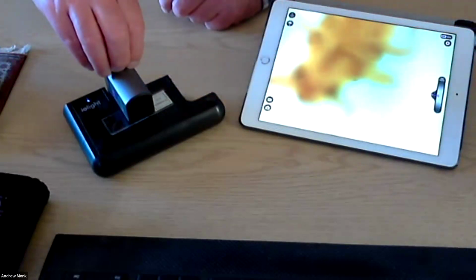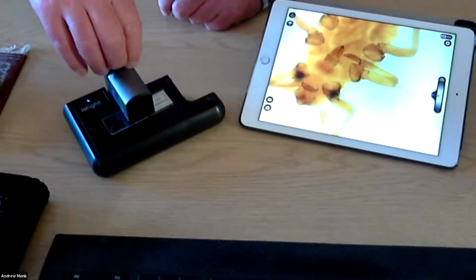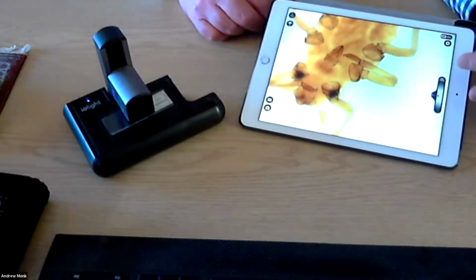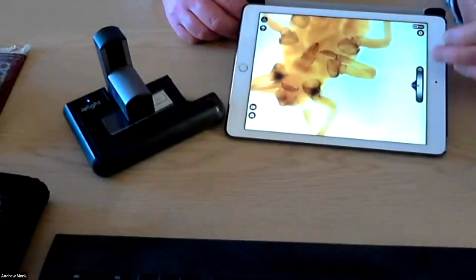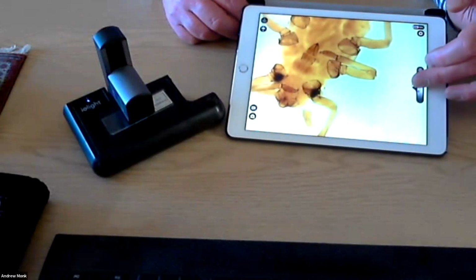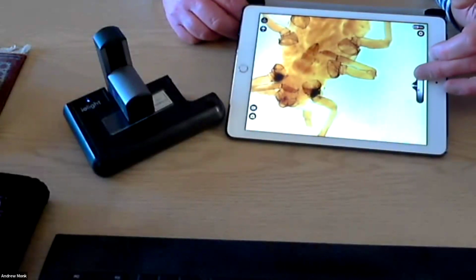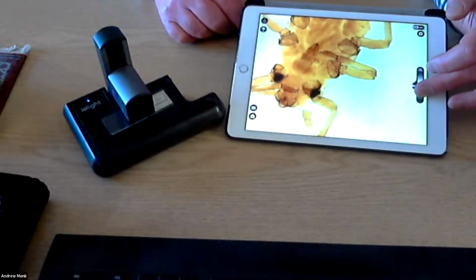And now I'm just going to focus it in a bit better. So you can get quite close just by hand, but you don't need to worry about that. Obviously, I've done that a few thousand times before. Because on the display here, there is a fine tuner, and this is actually moving the lens. So we can pick out any feature we like in the depth of field of this.